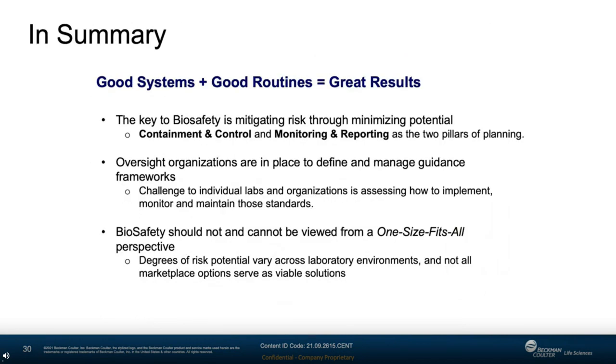When safety is a priority, a worker won't feel that they have to rush through a protocol. The lab should be set up with best practice in mind. For example, having a convenient place to balance tubes. Budget enough time for the work to be done and take the time to do things right.